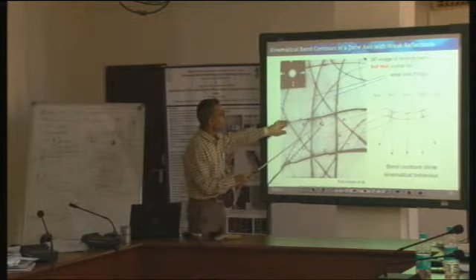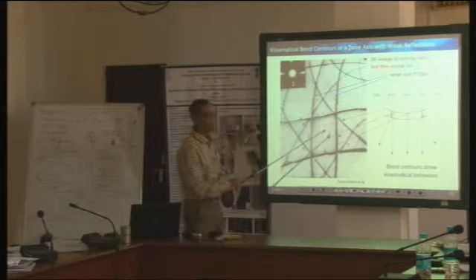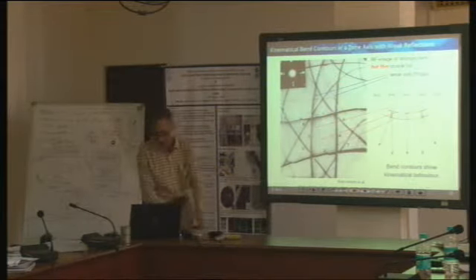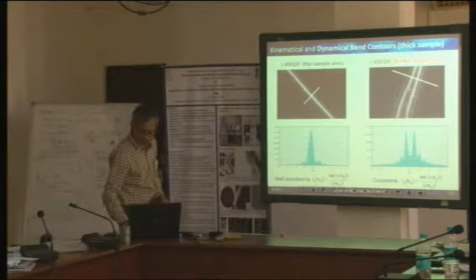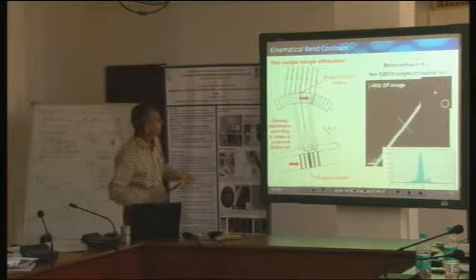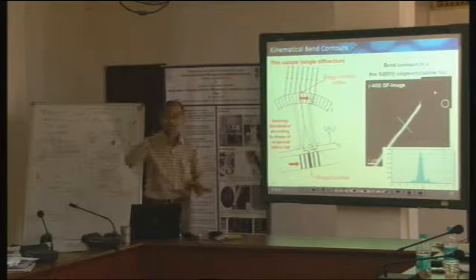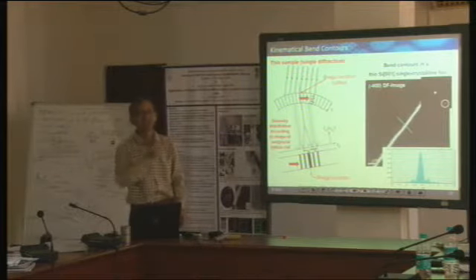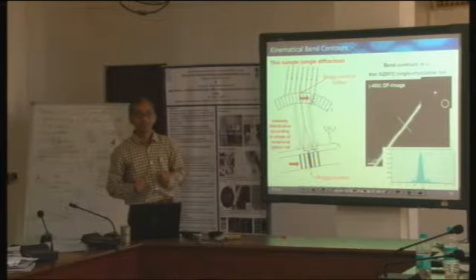And therefore, in the earlier case of the dark field, you will never be able to see the complete area. Let me make that point clear. When I make a dark field image using this G reflection, only that area of the sample will be visible where that Bragg diffraction condition is satisfied. No other area will be seen, isn't it?